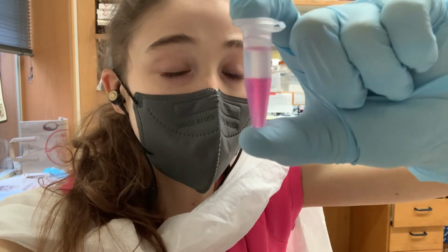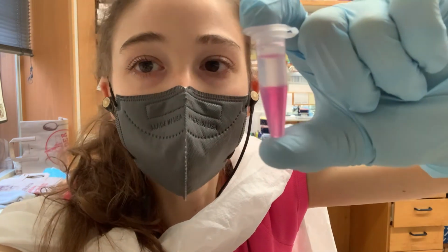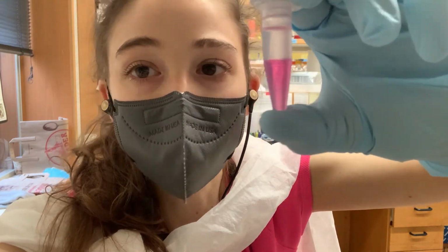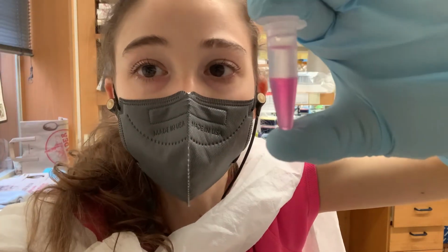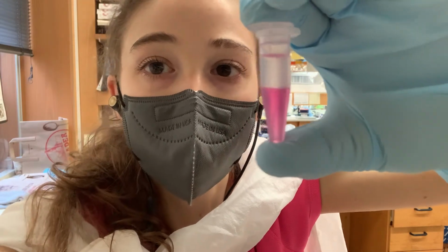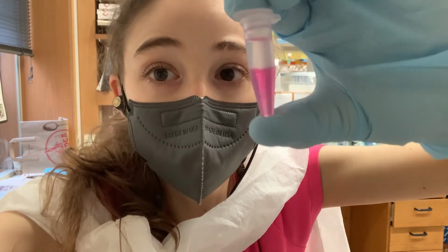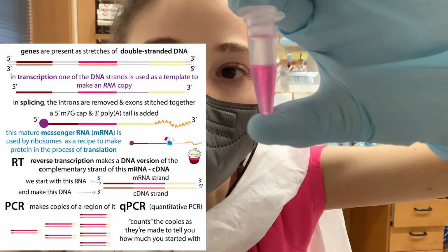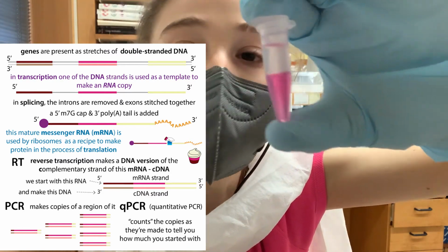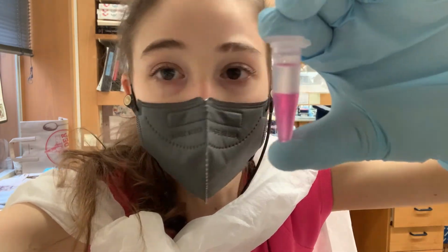TRIzol, aka guanidium thiocyanate phenol-chloroform extraction, is a way that we can extract RNA, so separate it from everything else, such as in a sample of cells, and isolate just the RNA. And it's really useful because often you want to, for example, see what genes it contains, like what mRNAs it contains, and so what the cell was making at that time. And there's also a bunch of other uses for isolating RNA.